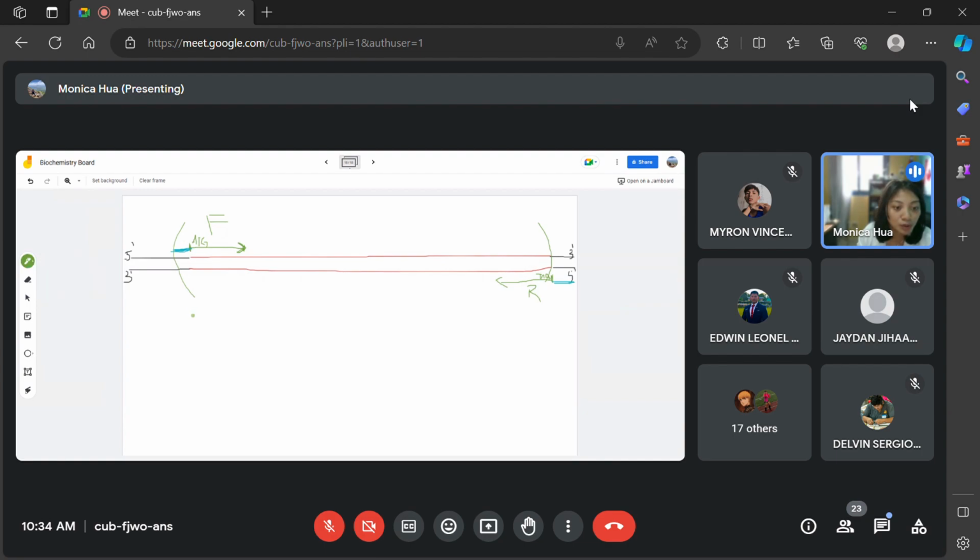So for example, your forward primer, which has the restriction enzyme site, as well as this, okay? This is going from 5' to 3', based on this direction. This one is going to be here, same 5' here.